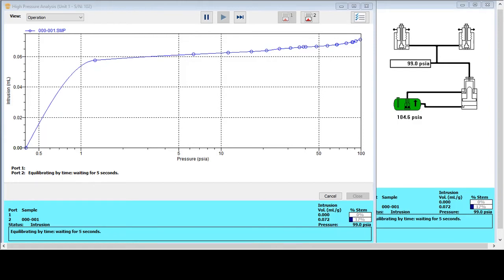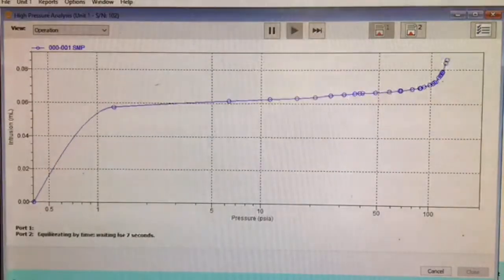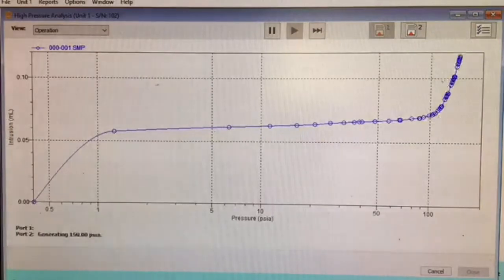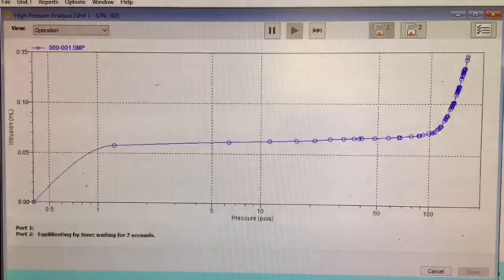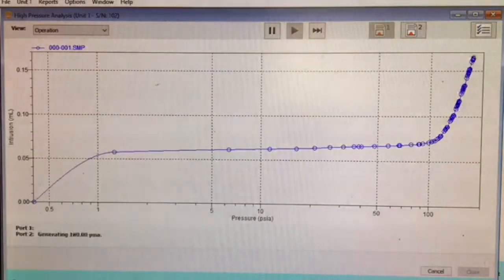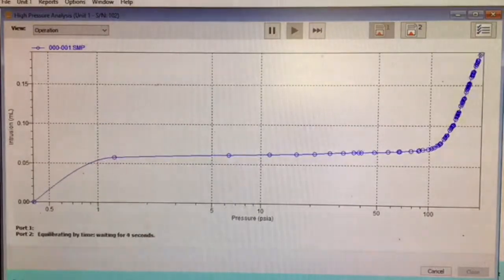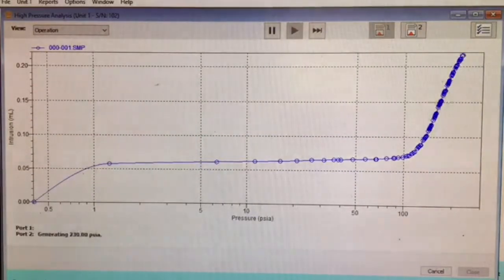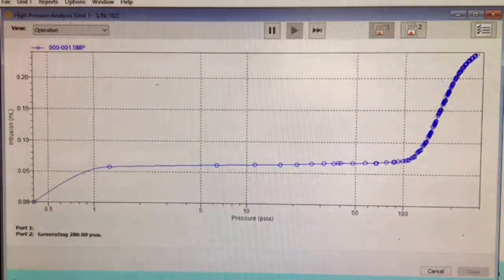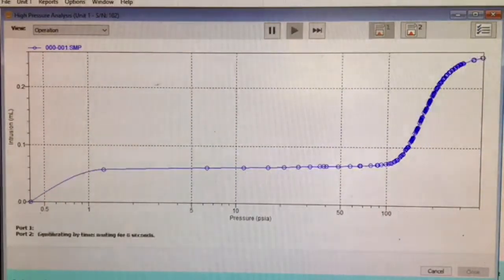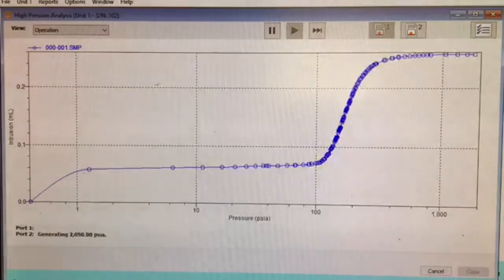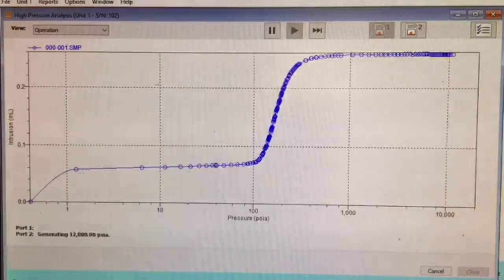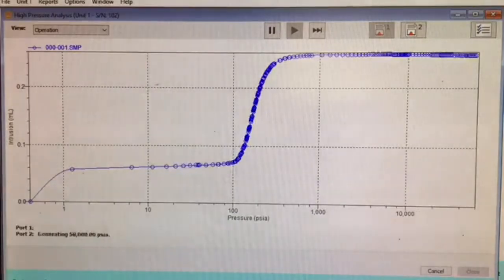So high pressure analysis can take some time and we're expecting somewhere around about 60 to 80 minutes for this particular sample. So rather than record this in real time, we're going to switch to a time-lapse version.